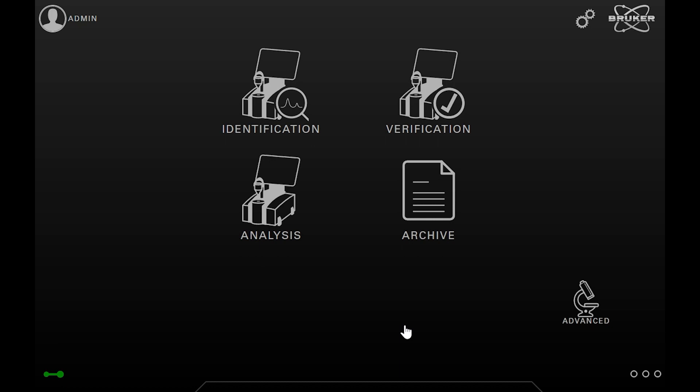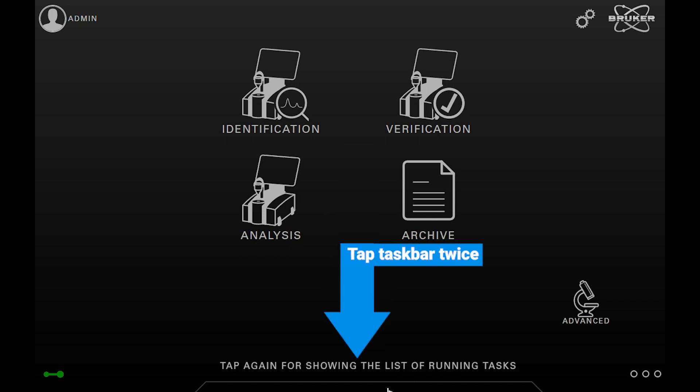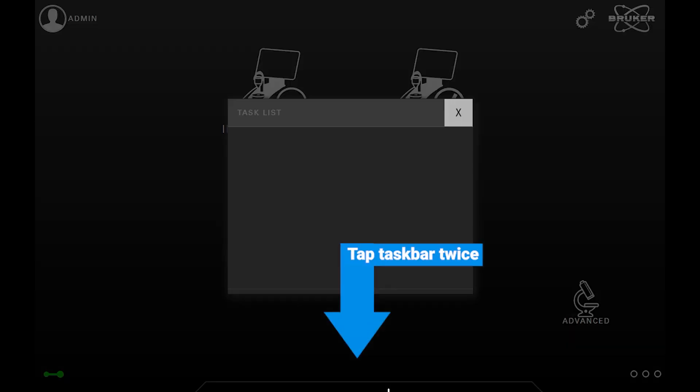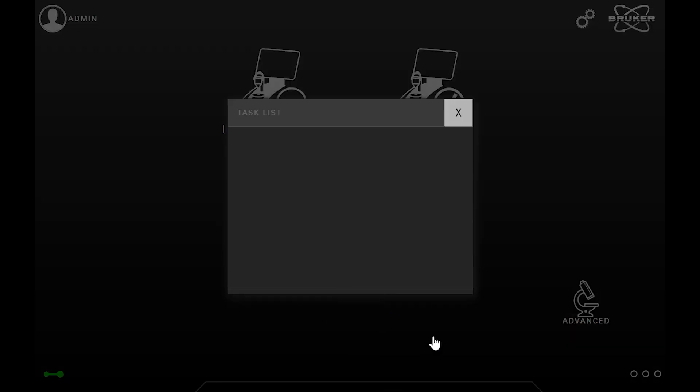You can open the task list by tapping twice on the task bar. It is also possible to terminate running tasks from here. Now the list is empty since there are no active tasks.